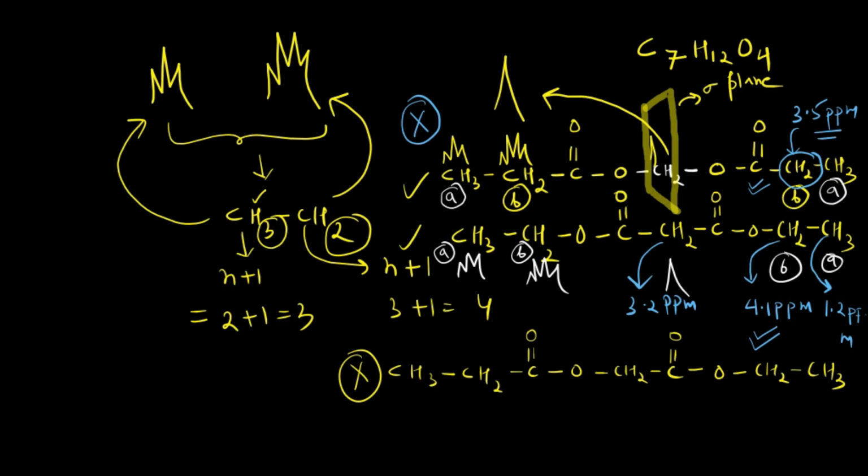It is very good to have an idea about the splitting pattern and all these things, but you have seen already both these compounds have the correct splitting pattern. But the correct structure is actually the second one, because this is more consistent with the chemical shift. The splitting pattern is the same in that case and in this case, right? So this molecule is actually the correct answer.